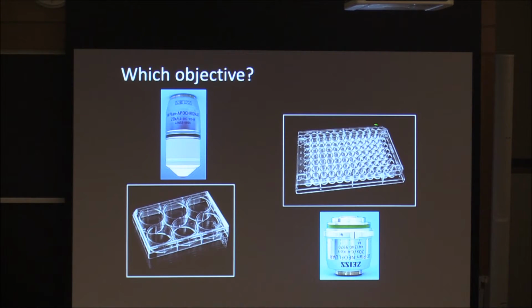All right? Another option, if you are stuck with these tissue culture plates with the really thick plastic bottoms, we do have some objectives that can work over longer working distances. So this is a special one, you can't see here, it says LD, it's a long distance objective, it's a 20x. This can actually image through that millimeter thick bottom and still quite deep into a sample. But you'll see you give up something for that.